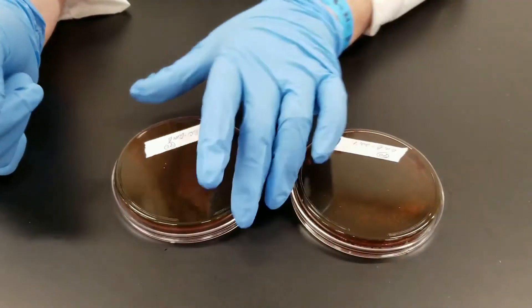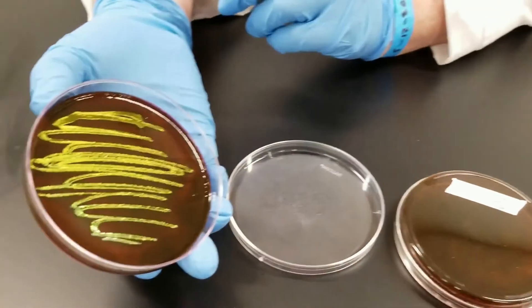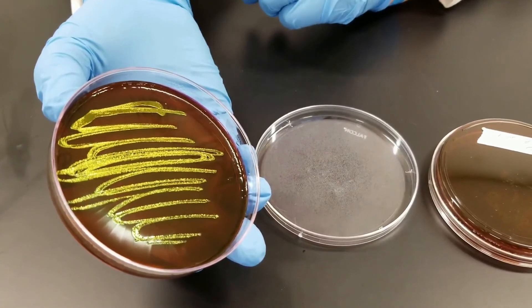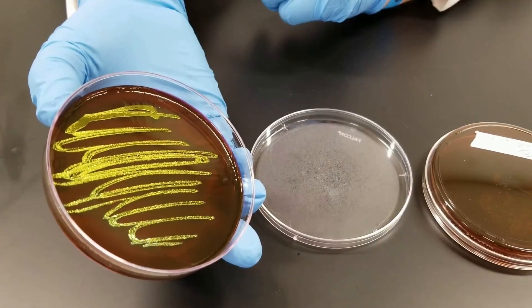To compare with this plate is E. coli. E. coli on an EMB plate has a very classic metallic green sheen to it. You see that shiny green sheen — and no doubt about it, that is E. coli.